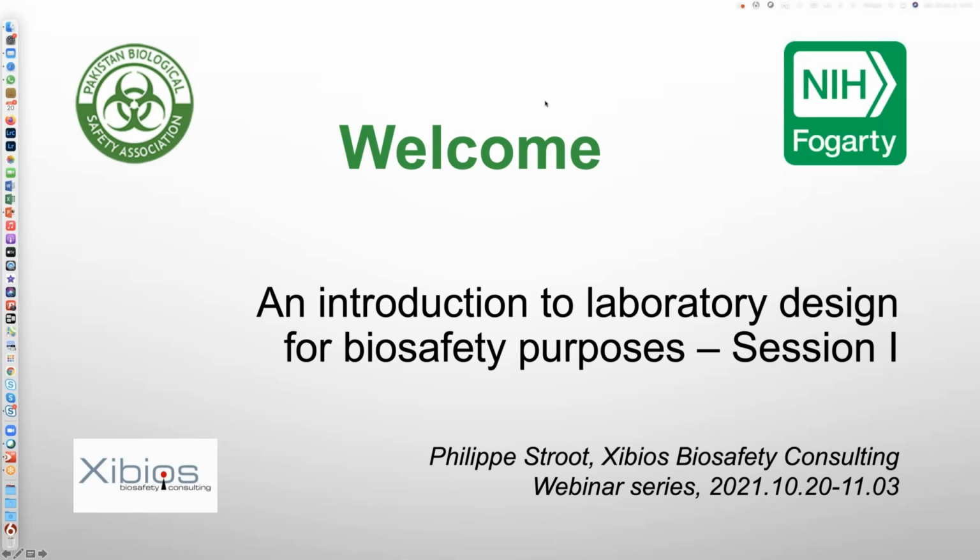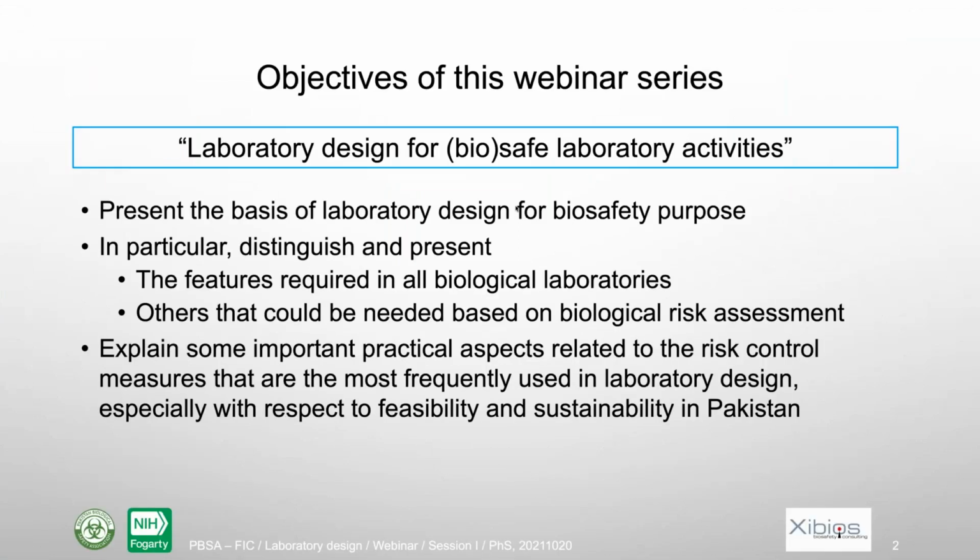Actually, it will be an introduction to laboratory design, and what I would like to do during this webinar is first really present the basis of laboratory design for biosafety purposes. So we are really looking at biological labs, and in particular, according to the new WHO manual, I want to distinguish and present the features required in all biological laboratories, and then some others that could be needed based on biological risk assessment. Also, I want to explain some important practical aspects related to risk control measures that are the most frequently used in laboratory design.